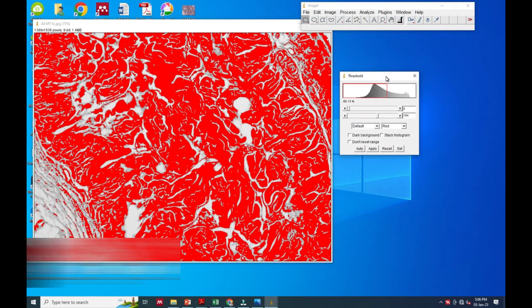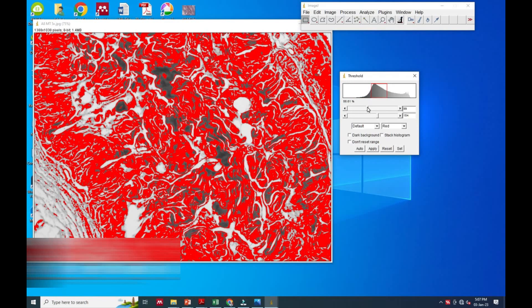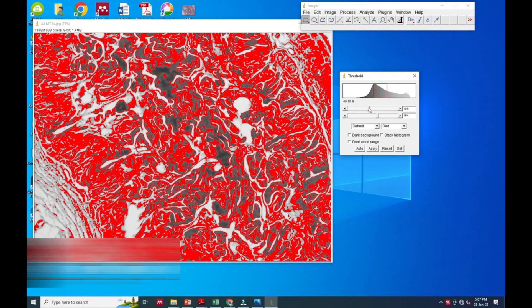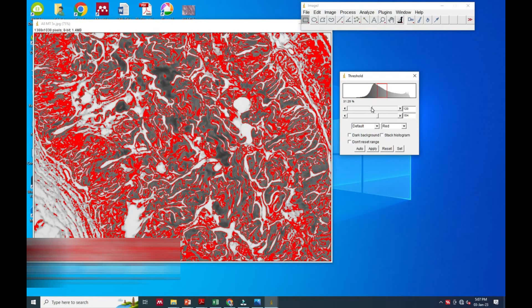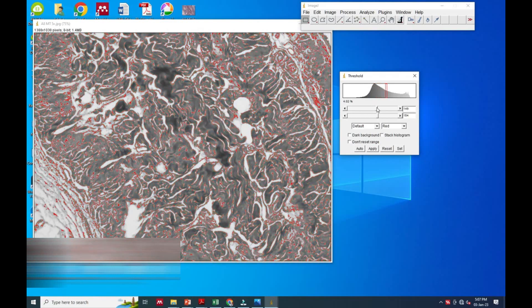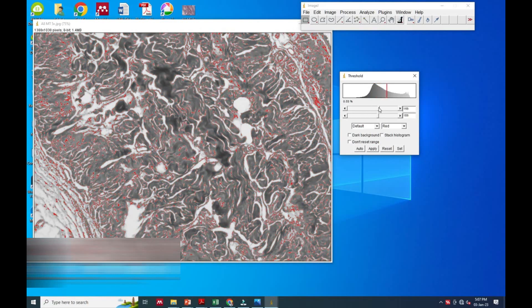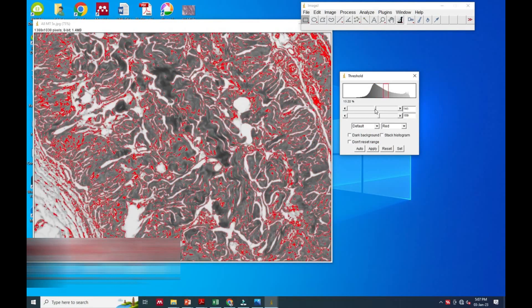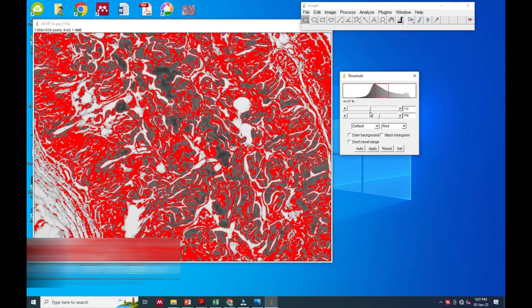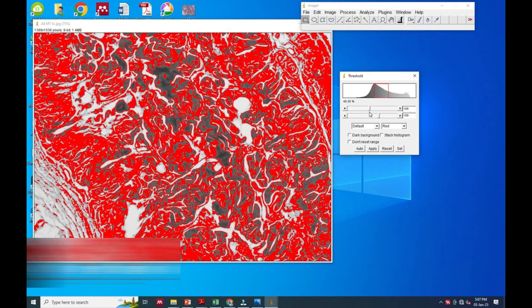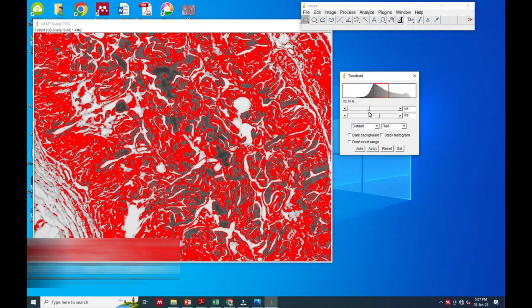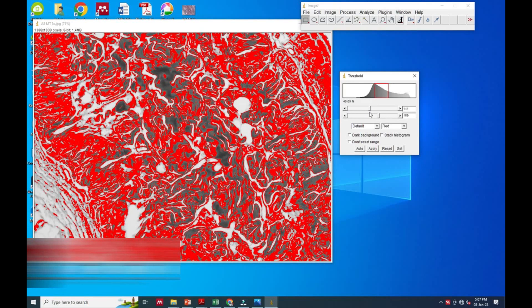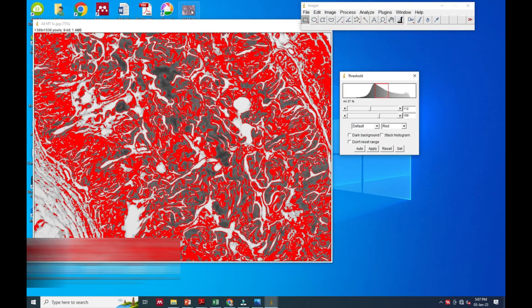In that it has given drag options, so we have to choose which color to select. It has given two options - two colors we can choose from the image. The upper option is for blue color and the lower option is for the remaining red color. We have to choose the blue color so we will select the blue one from the image.